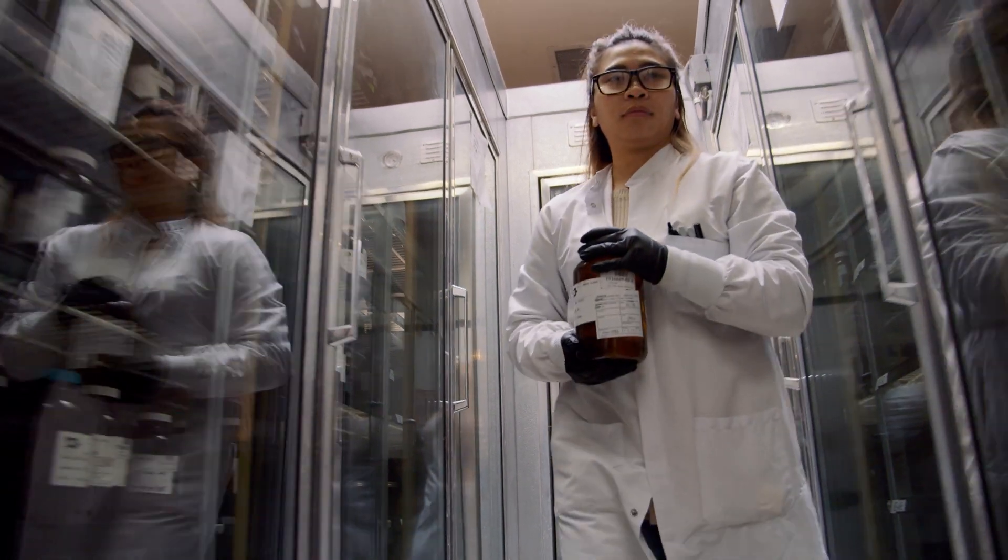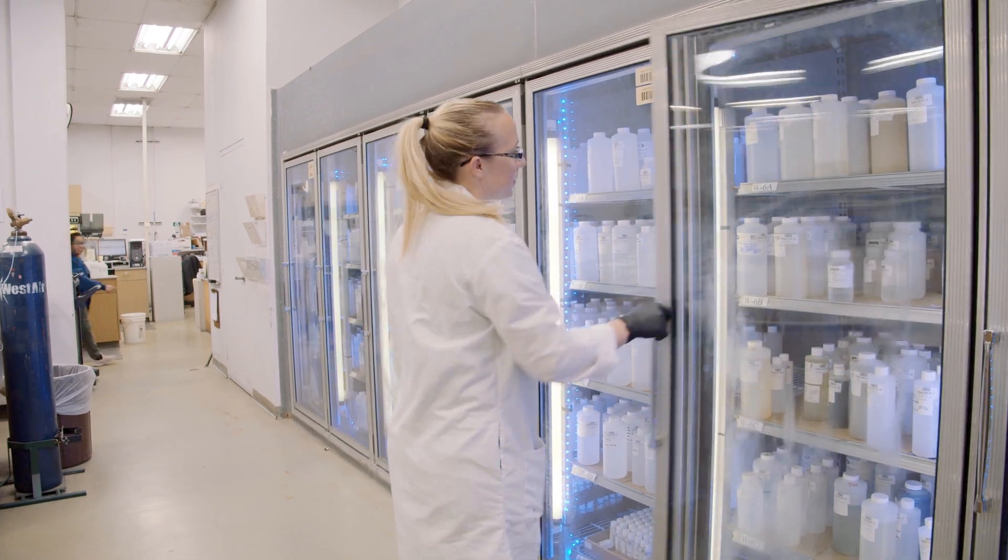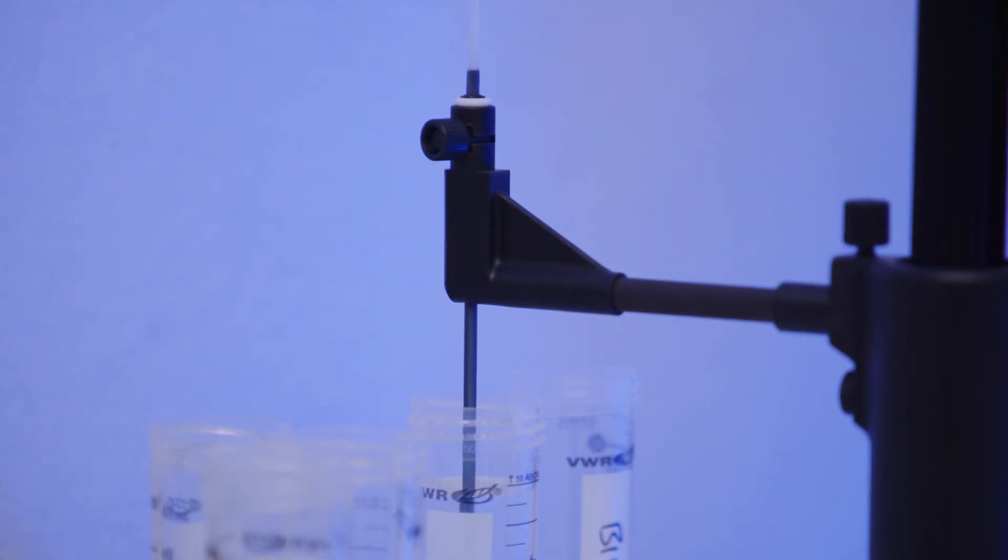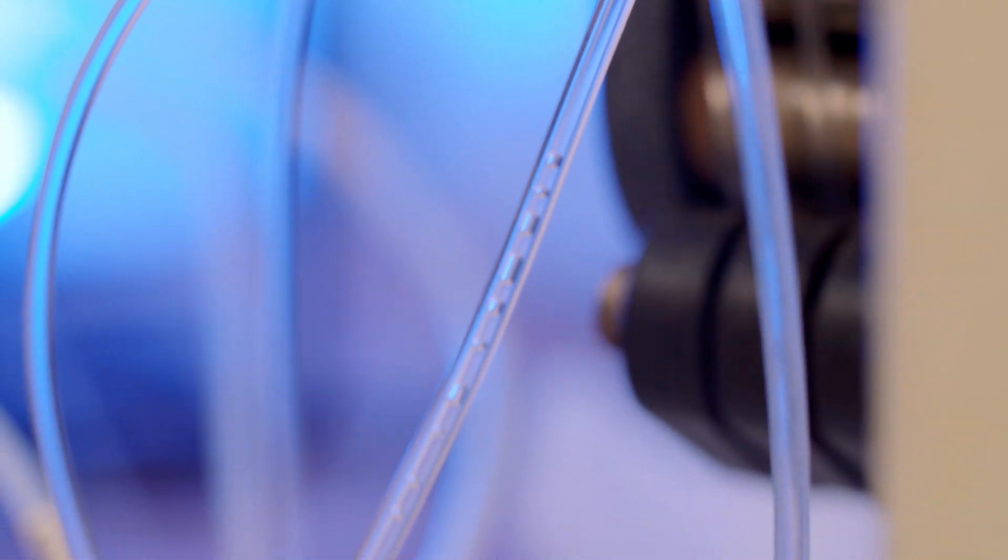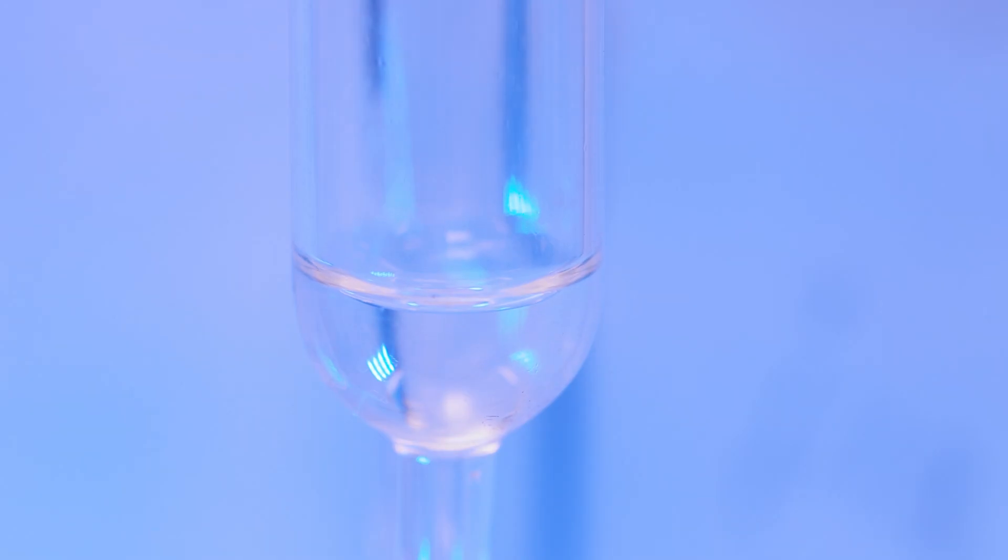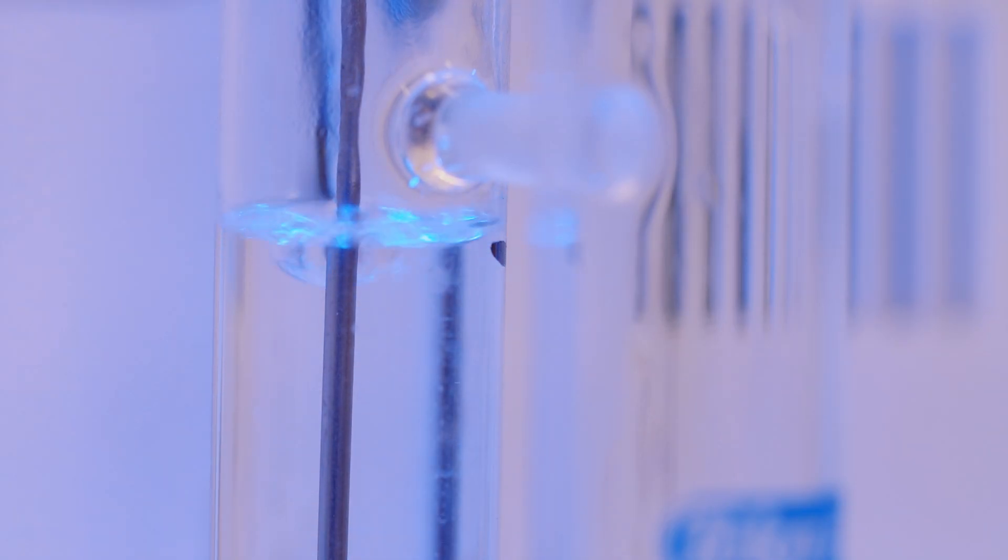They are placed in refrigerators prior to preparation and analysis. Many of the specific elements or compounds we analyze for are temperature and time sensitive, hence the careful control of sample temperatures once they are received in our laboratory. Water and soil samples are chilled in our refrigerators to under 6 degrees Celsius, then sent for preparation in separatory funnels, distillation, digestion.